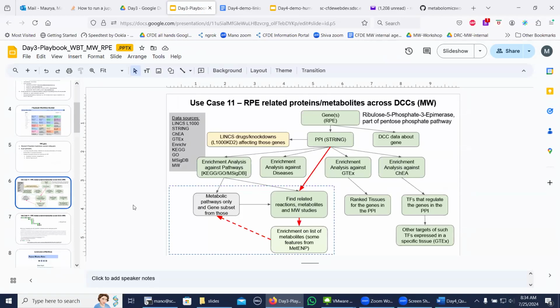So here is an example of a workflow. Of course, in this one, for demonstration purposes, this workflow was prepared in PowerPoint for readability. It is not necessary that all the components from this be available in the workflow builder tool, but nevertheless, most of them are. In fact, in this case, I believe all of them are available there.